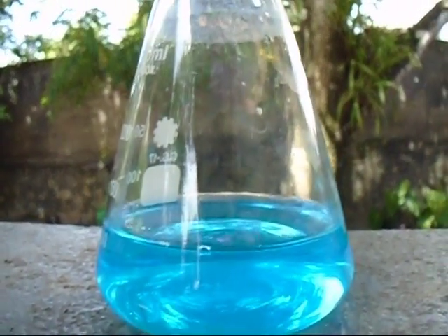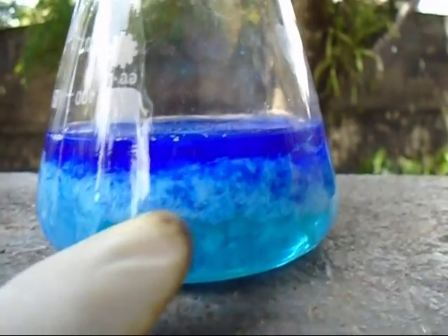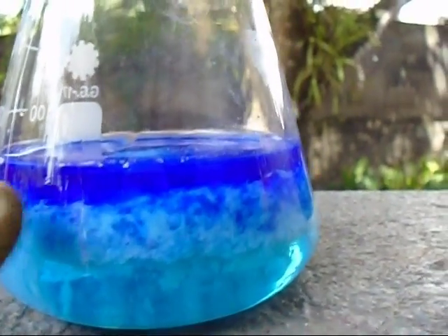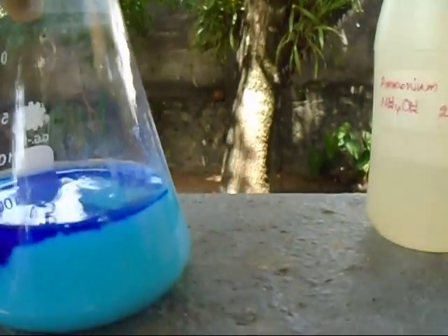Now we have an aqueous ammonia solution here. I mix the copper sulfate and ammonia solution. You can see there is copper hydroxide forming, and the top layer is an ammonium compound of copper. We totally dissolve this ammonia to get a lower layer solution.